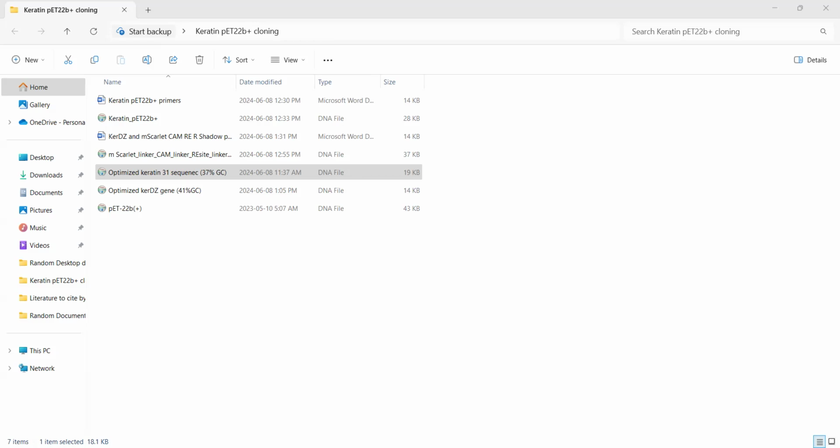What this means is that when we are setting up parameters for PCR, we'll put annealing at 65 degrees, and we need to know the size of the fragment, because usually it goes 30 seconds per kilobase, and we have 5493 base pairs, so we need to know how long this extension time will be. So it will be around 3 minutes.